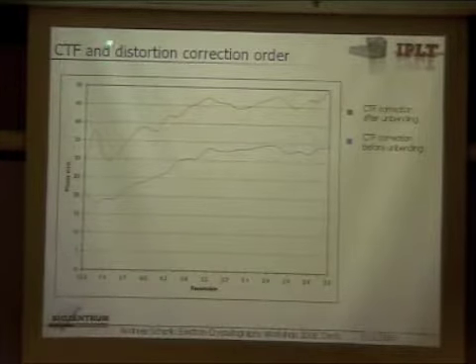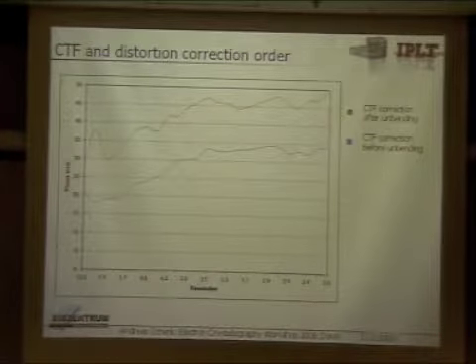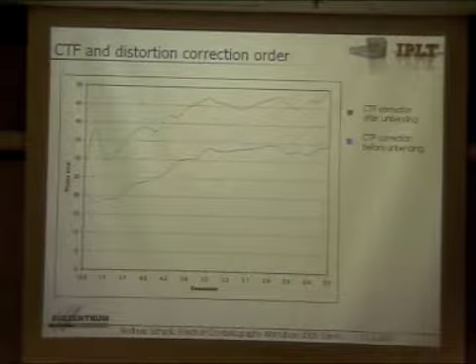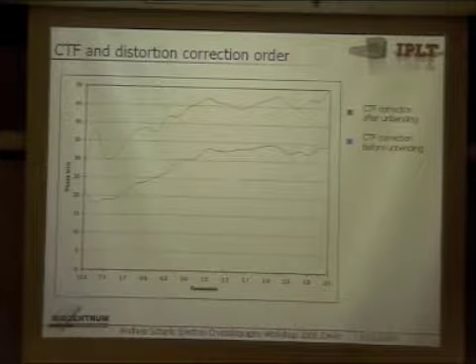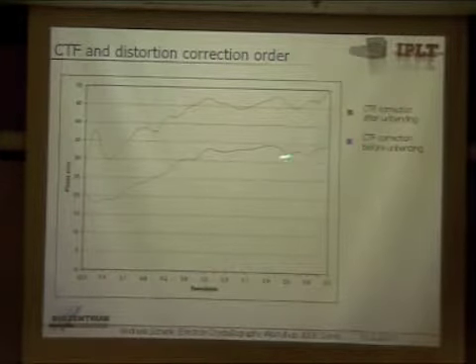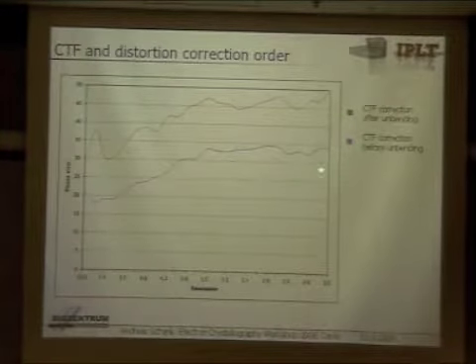And here on the y-axis, you see the phase error. And that's for the original CTF Unbending. So already here we use the original CTF Unbending from the MRC. And if you first do the CTF correction, you get this kind of error. So it starts around 20, at 2.5 angstrom, you're at 30.